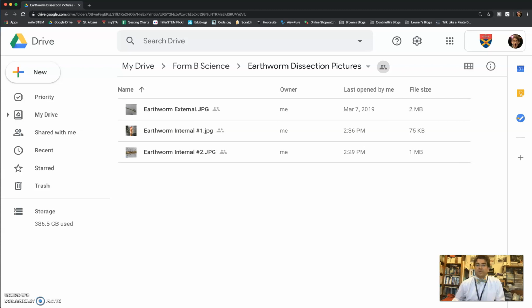Hello, this is a screencast to review the earthworm dissection. We'll be going over both the external parts of the earthworm as well as the internal parts and talking about the functions of all of the parts.